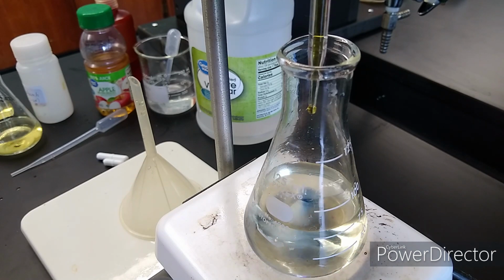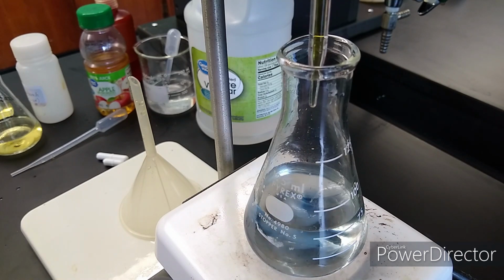Bing! Bing! 2 drops. Ooh, let's go ahead and go for a 3rd drop. Remember, the color's gotta stay for 30 seconds or longer. 3, 4 drops. Ooh, I think that's gonna do it. 5 drops. That's definitely the end point. A little bit past it by a drop or so.